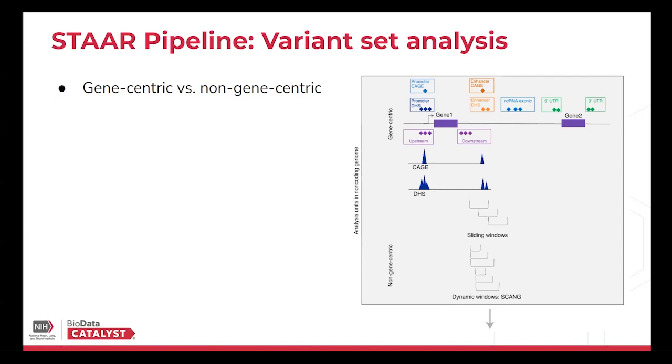So for non-gene-centric analysis, the STAAR pipeline includes features like sliding window analysis with fixed sizes or dynamic sizes. It also has in-depth analytical follow-up of really dissecting the association signals independent of known variants, and that's through the feature called the STAAR pipeline summary.